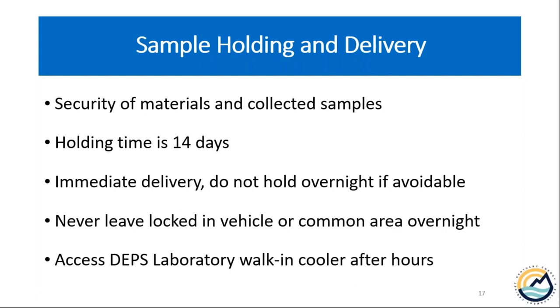The security of materials and collected samples is very similar to any other monitoring that you've done. Holding time on these samples is 14 days. However, because of the potential for cross-contamination, we try to deliver samples immediately to the lab and not hold them overnight if we can avoid that. I don't like to leave these in a locked vehicle overnight, again, because of the heightened potential for cross-contamination. And we definitely never leave them in a common area overnight, like we might some samples in a storeroom or a warehouse where we could come back and get them the next morning.